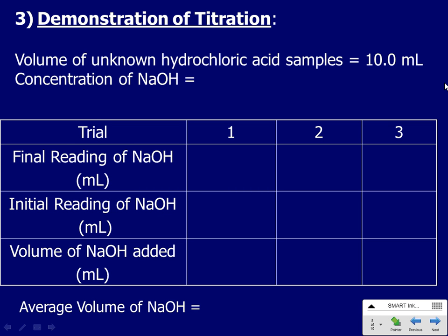I'll have Sharpie markers out there as well, and the reason why you have to have Sharpie markers is because you've got to label your beakers base and acid and water, all right? And the extra one that you're going to grab is a waste container. In other words, you're going to put just some stuff that you use as cleaning agents in there. It's essentially the same as having a sink nearby because we don't have sinks on our lab benches here. So you'll have a waste container, and I'll put that by the sink.